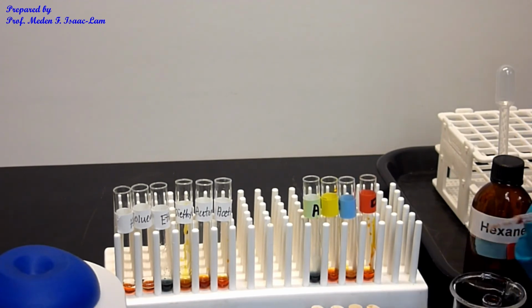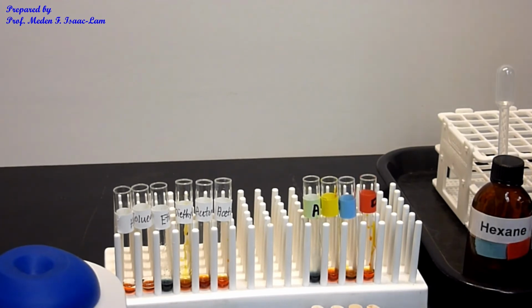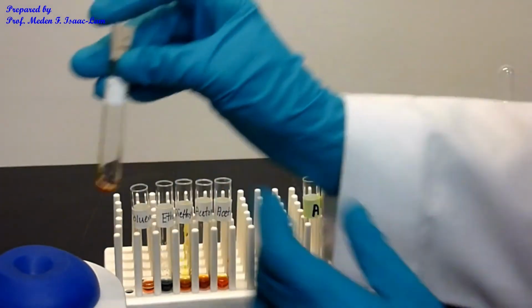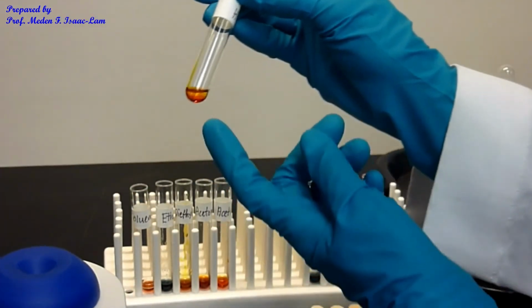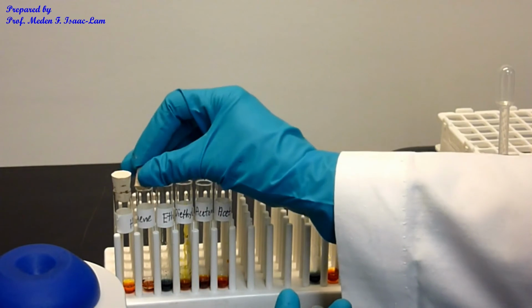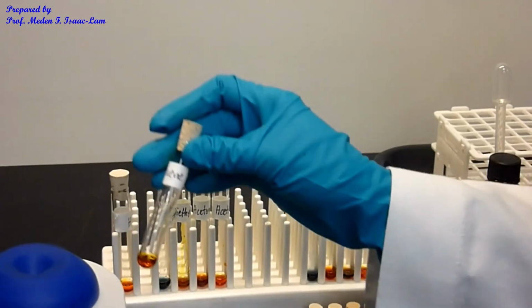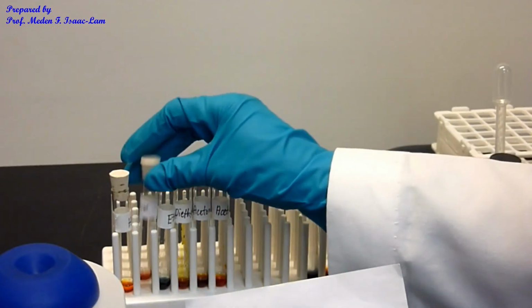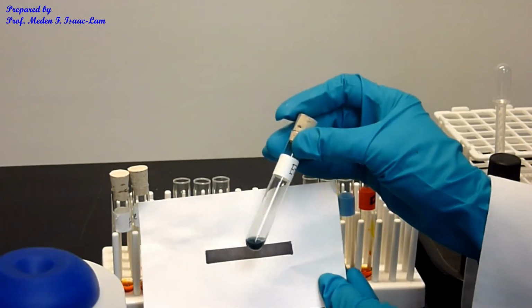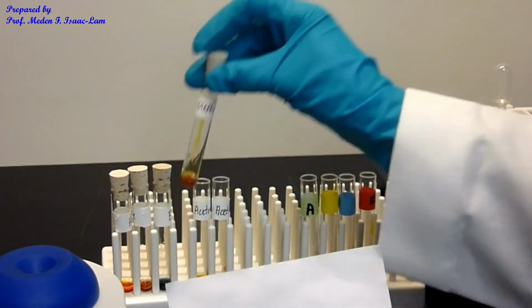So let's review. Okay, so now hexane, so I'm gonna mix it up. So hexane is orange in color, and then toluene. So toluene is orange in color, okay, and then now ethanol turned green, okay, and then diethylamine had some reaction.